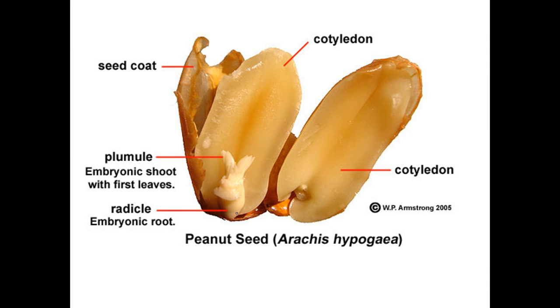So the first question says that food may be stored for the use of an adult plant or as energy for the development of an embryo. The stored food is packaged with an embryo into a structure called a seed. And so that's what this peanut was. Here again we have that stored food supply. Here we have this little seedling. And all together this is considered the seed.